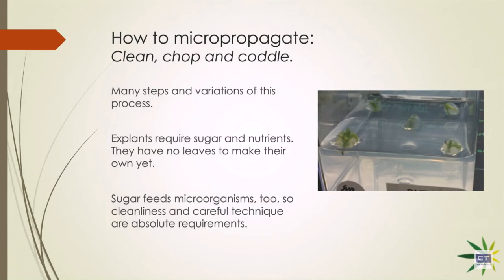Okay. All you really need to do to slow them down at this stage is just lower the temperature and dim the lights. They just slow down. They still keep growing. You still have to look at them once in a while. But they just hum along and operate at a lower temperature. Chemical reactions in general just go slower at lower temperatures, and so growth just has to go slower because of physics.